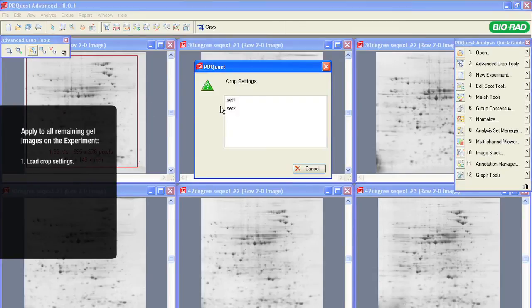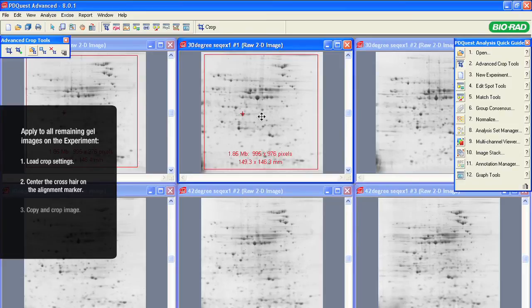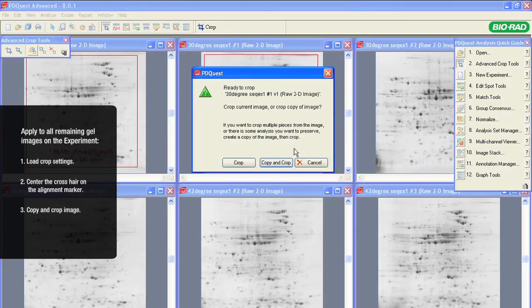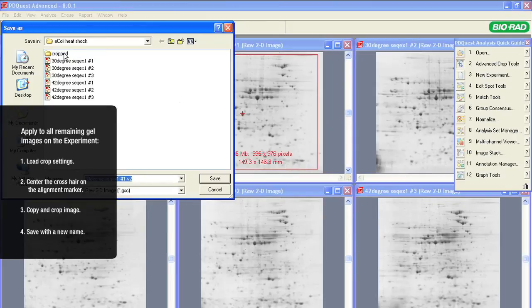Now, we will go through the same process on the remaining gels. Load the saved crop settings. Center the crosshair of the alignment marker on the anchor spot. And, using the Copy and Crop button, save the cropped image with a new file name.